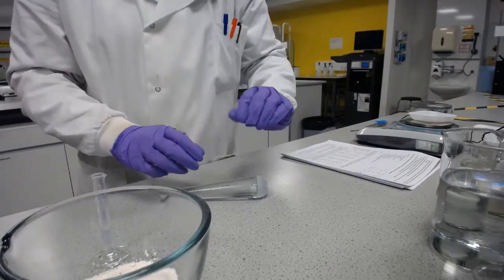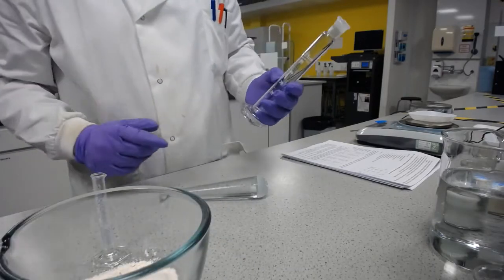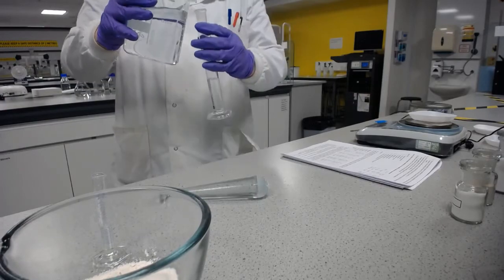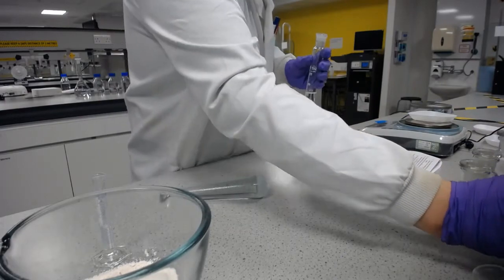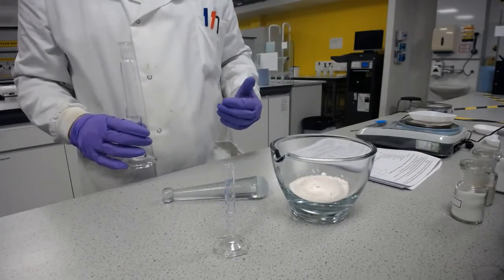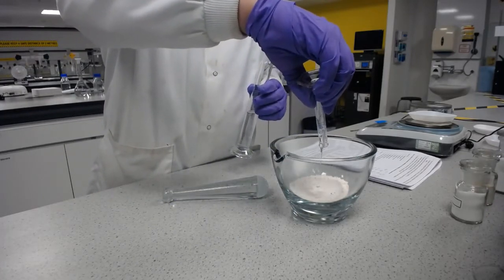Excellent. So I'm at the stage where I can do that, and I know that we're going to have up to 50 millilitres. And so what I'm going to do is put 30 millilitres of water into a measuring cylinder, roughly 30, and then use that to get everything that's in here and the glycerin to a pourable consistency. And then I know I won't have gone over my final volume. So let's pour the glycerin in as much as we can, as it is.